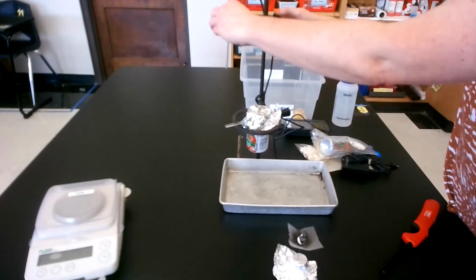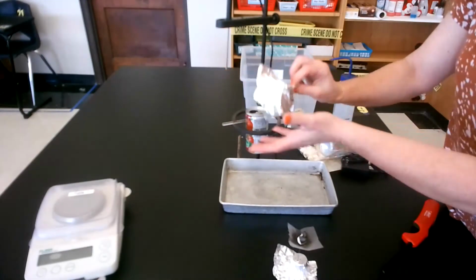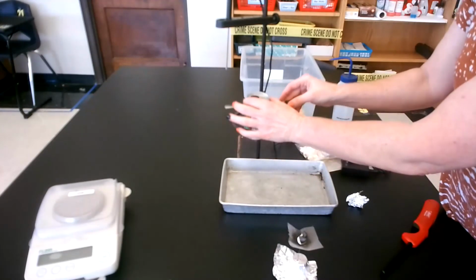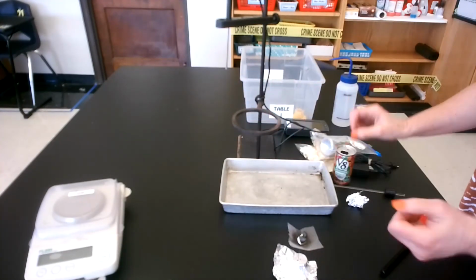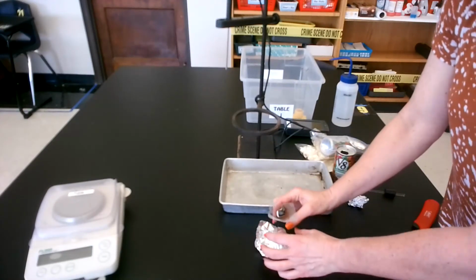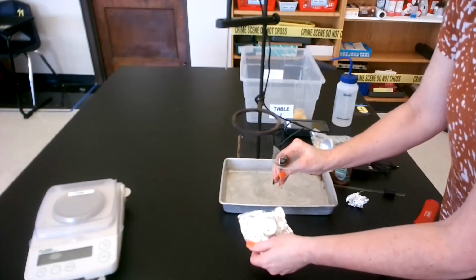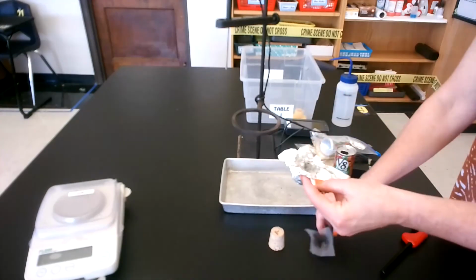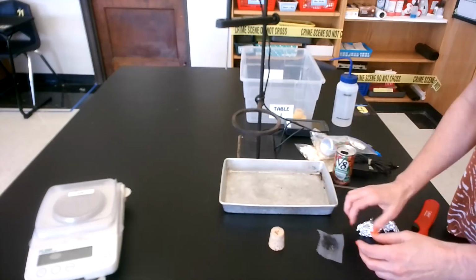So I'm going to move my thermometer out of the way. I'm going to take my foil, I'm going to throw it away. Then I'm going to take my can apart. For my food holder, I'm going to throw my foil away, and I'm going to dump the big pieces of food in here, and then that's going to be thrown away.